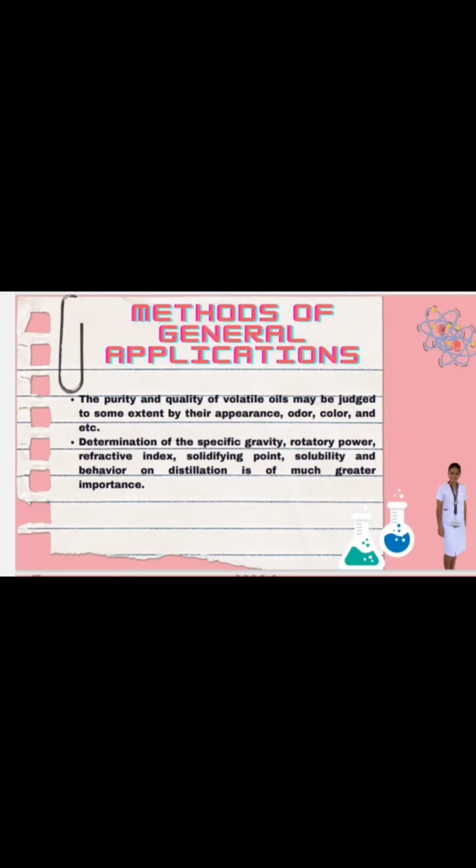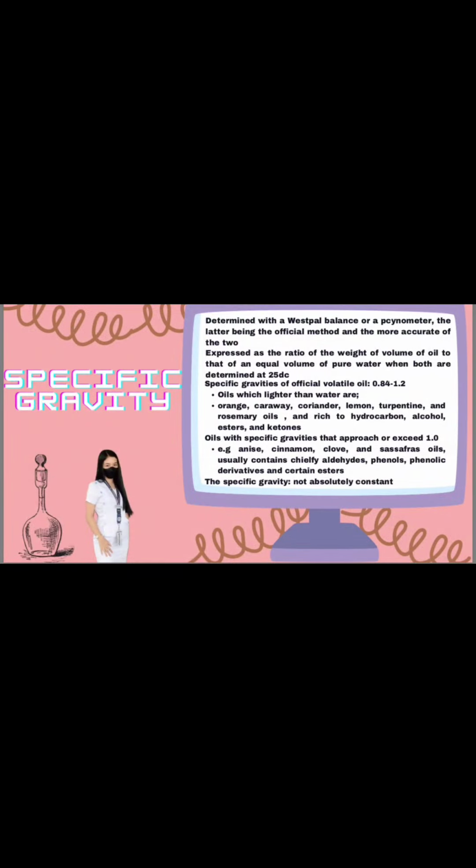The purity and quality of volatile oils may be judged to some extent by their appearance, odor, color, etc. Determination of the specific gravity, rotatory power, refractive index, solidifying point, solubility, and behavior on distillation is of much greater importance. The specific gravity of a volatile oil may be determined with the Westphal balance or a pycnometer, the latter being the official method and the more accurate of the two.